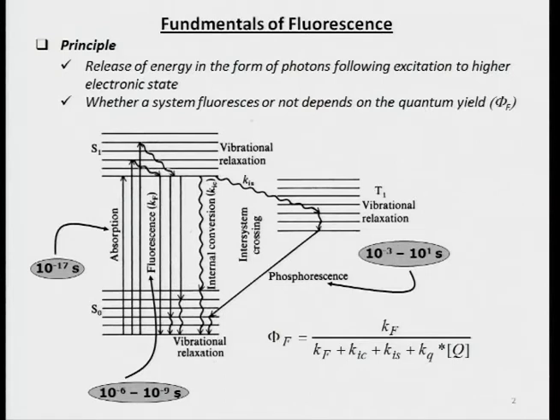And therefore, depending on what the changes are, and because it's slow, which allows those changes to happen, the photons that come out can be detected and give a lot of information about what the system is undergoing. Likewise, phosphorescence is even more delayed, and it can also give you a lot. But this is really a slow process. This is essentially like you hit somebody today and you get slapped back years later.